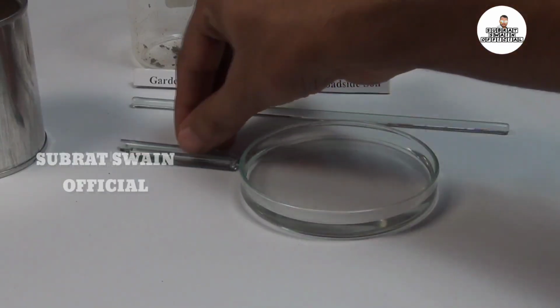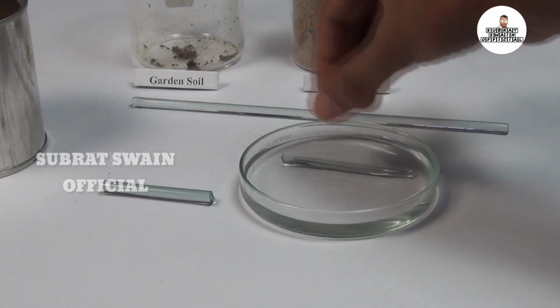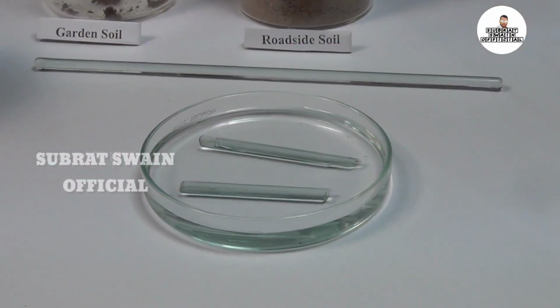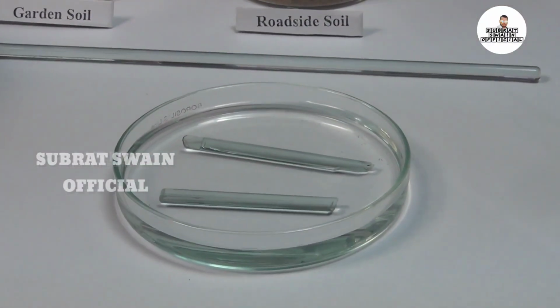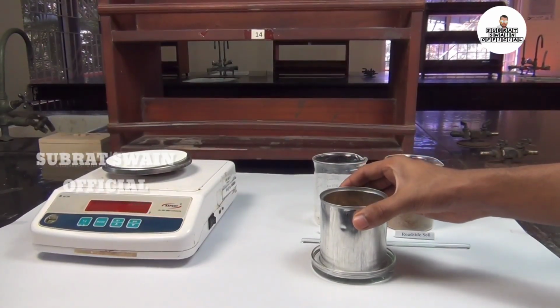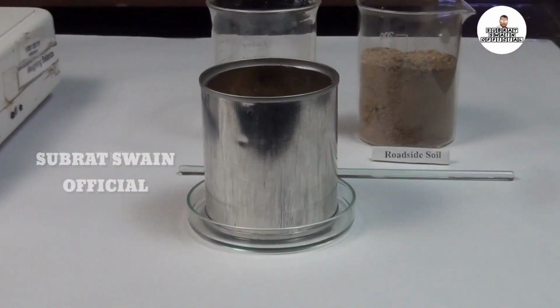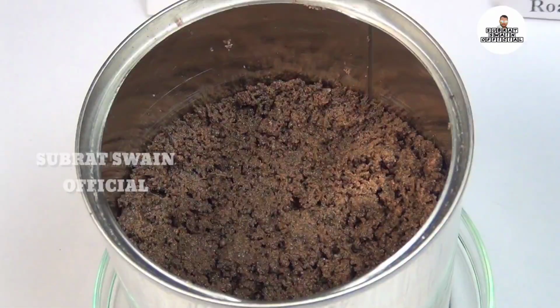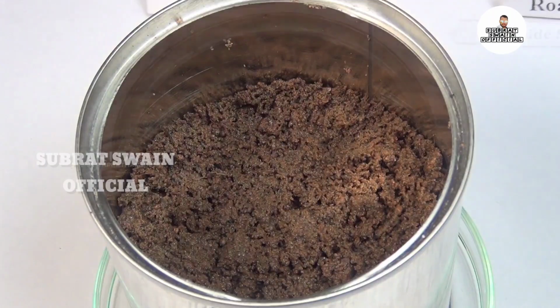Take a petri dish filled with water. Take 2 small glass rods and place them parallel to and at a small distance from each other. Place the soil-filled tin on the 2 glass rods in such a manner that its bottom is in contact with water. Leave the setup undisturbed till water appears at the upper surface of the soil.